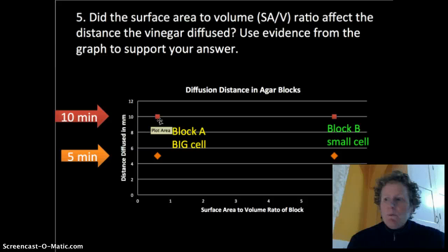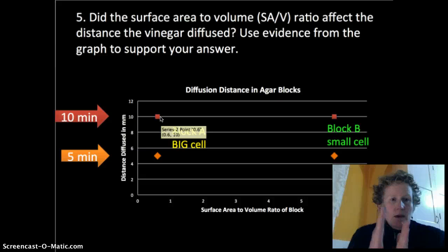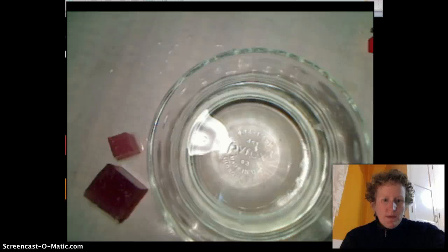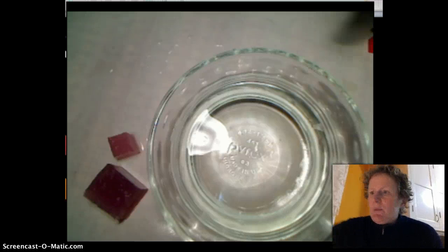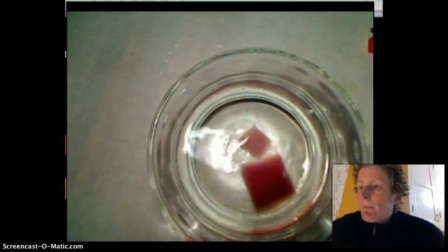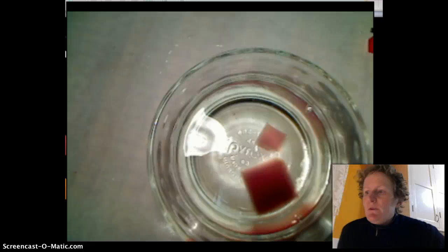After 10 minutes, we'd only see the same thing. I'll throw a couple cubes in there just to check, but we're going to see that it just travels at the same rate. Plugging along, and after 10 minutes we'd see that we got 10 millimeters of vinegar diffused through.